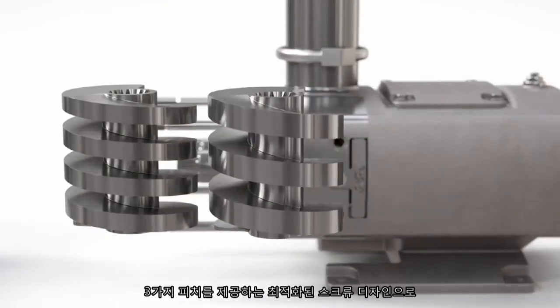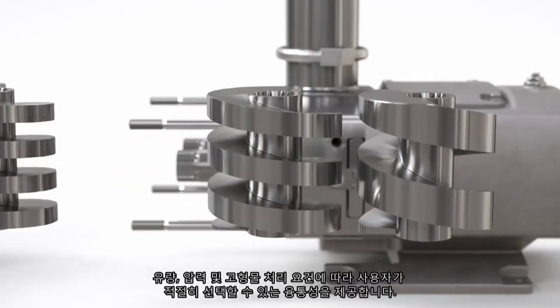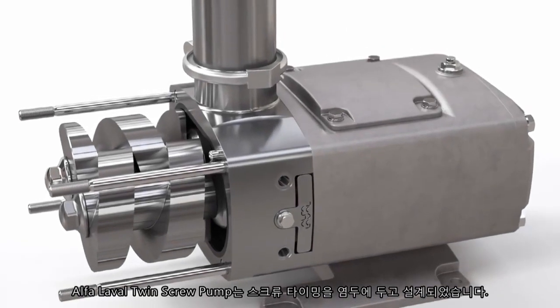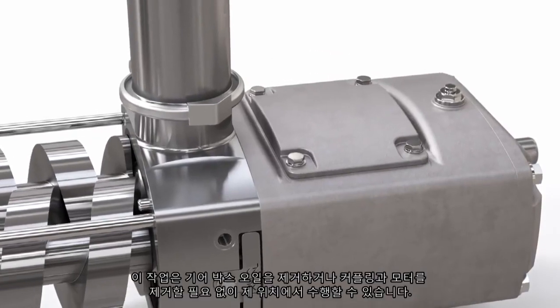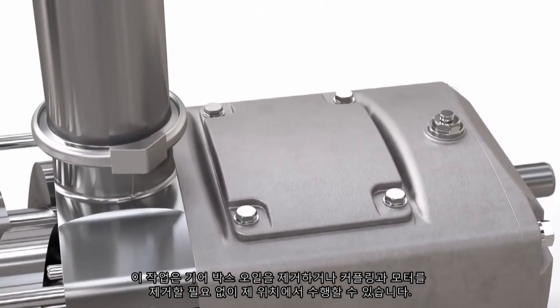The optimized screw design with three pitch variants provides process flexibility to select according to flow, pressure and solids handling requirements. The Alfa Laval twin screw pump is designed with easy screw timing in mind, which can be done in position without the need to drain the gearbox oil or remove the coupling and motor.